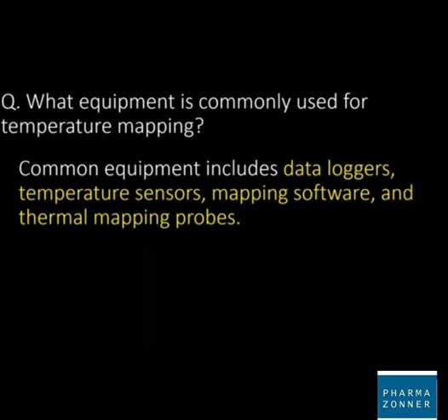Next question: what equipments are commonly used for temperature mapping? Answer is, commonly used equipments are data loggers, temperature sensors, mapping softwares, and thermal mapping probes.